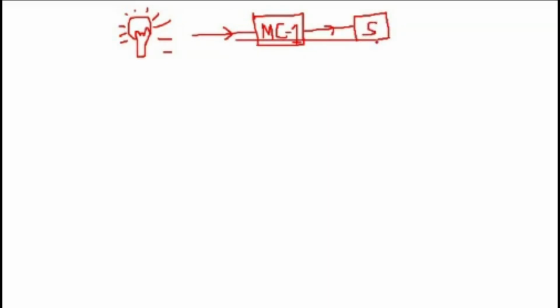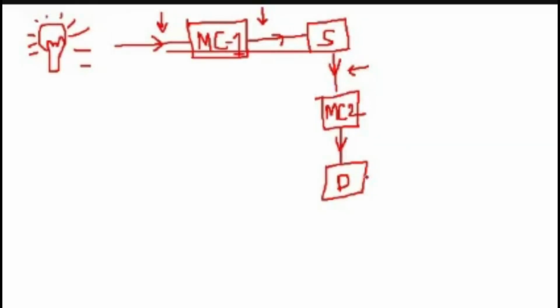This is your sample. Okay. From the sample, the emission spectra will go to monochromator 2. Now, listen carefully to what I said. I said the excitation spectra is converted to a single wavelength. Then there is the emission spectra coming over here. It will be converted into a single wavelength, and then it will be detected by the detector. Then it will be amplified. Then you will get the reading. Now, what I'm trying to say here is overall what is happening in the process. So what is the detector measuring? The detector is measuring this wavelength selected by this monochromator.